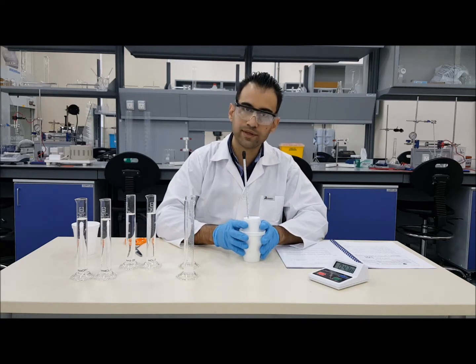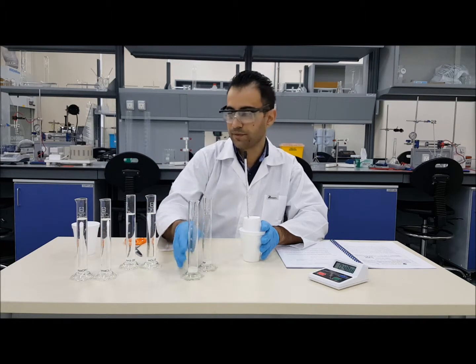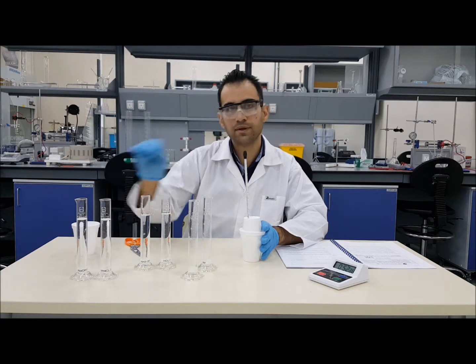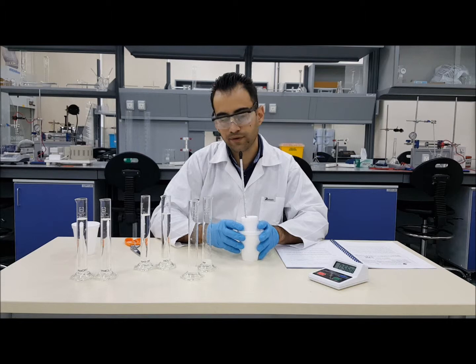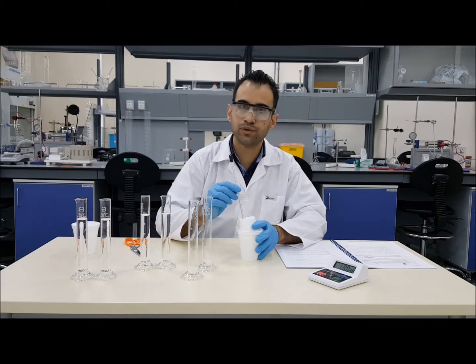As you are done with this, you will need to use new cups for the other sets of chemicals you got. As I mentioned, you will be doing this experiment 3 times during the lab, so you will be using 3 different sets of cups. However, the thermometer, you can just wash, dry it, and use it again.